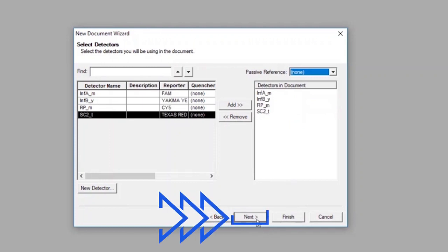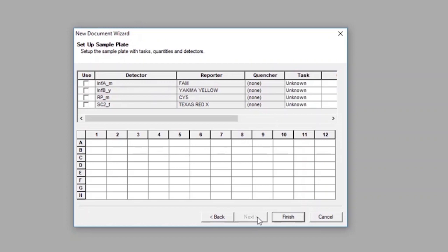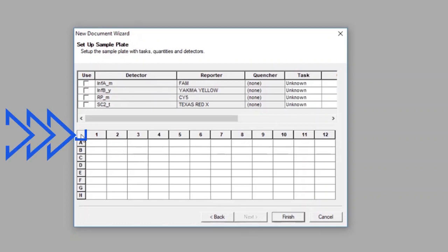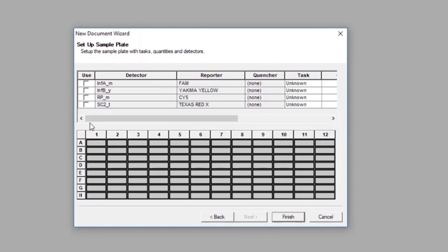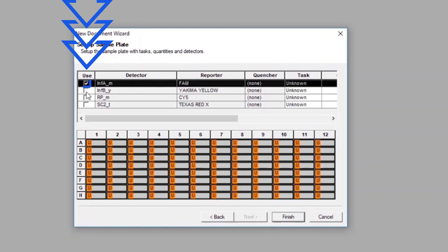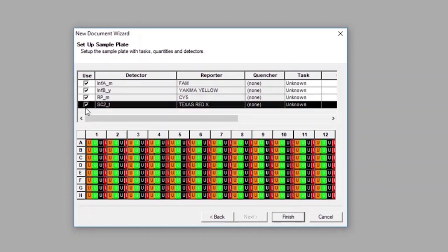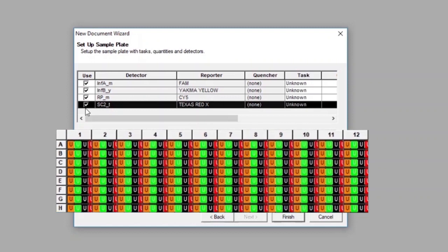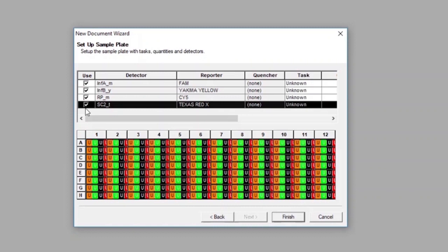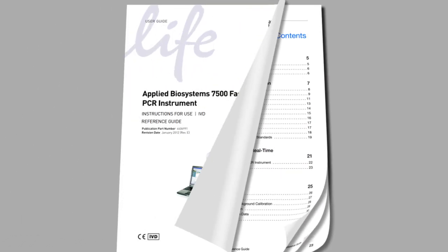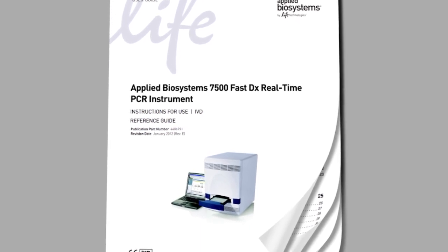Click Next at the bottom of the Select Detectors window to proceed to the Setup Sample Plate window. In the Setup Sample Plate window, select all the wells in the plate. In the top portion of the window, select all four detectors in the FLU SC2 Multiplex Assay: Influenza A FAM, Influenza B Yakima Yellow, RNase P CY5, and SARS-CoV-2. A checkmark will appear next to each selected detector, and the selected wells will be populated with four colored U icons. Click the Finish button after detectors have been assigned to each well. Note that the instrument must be powered on for initialization.